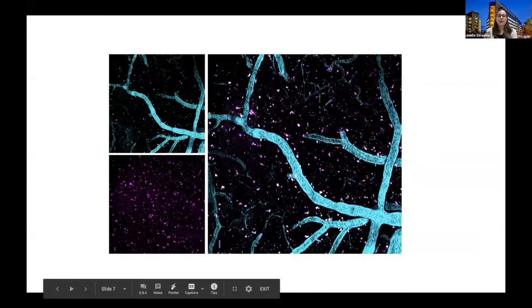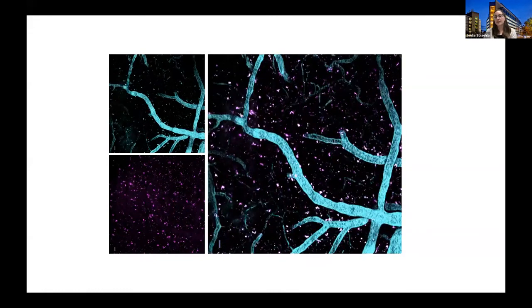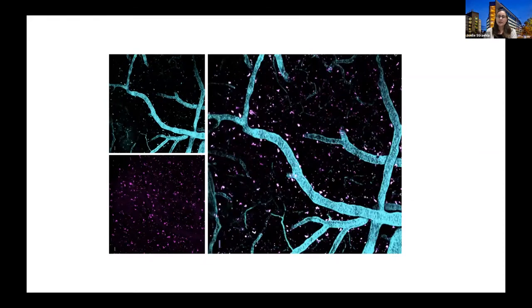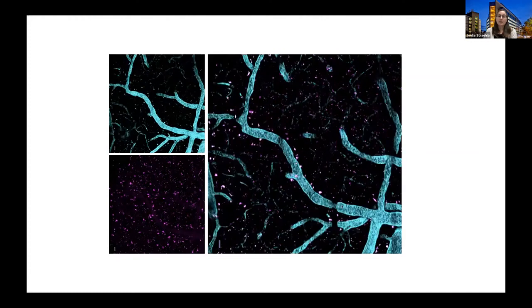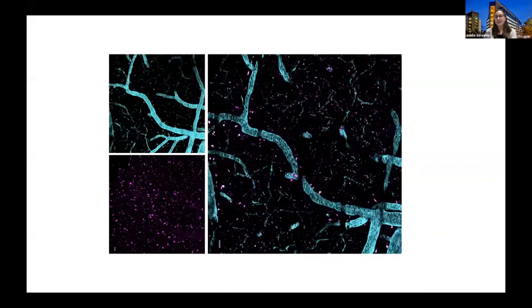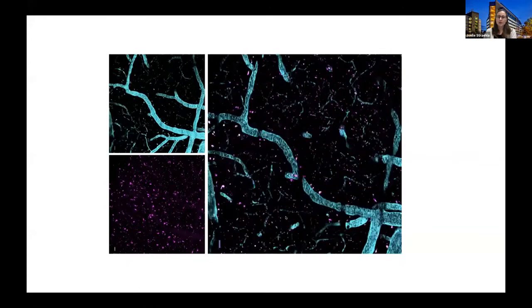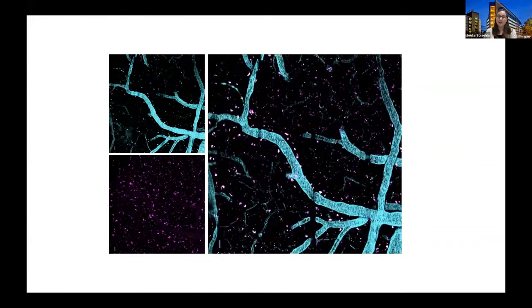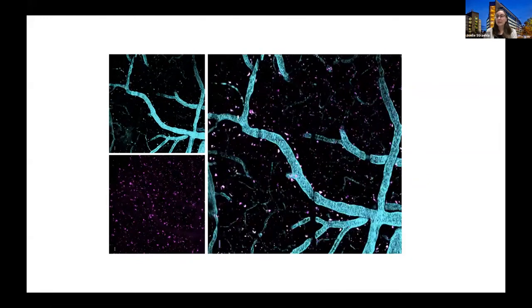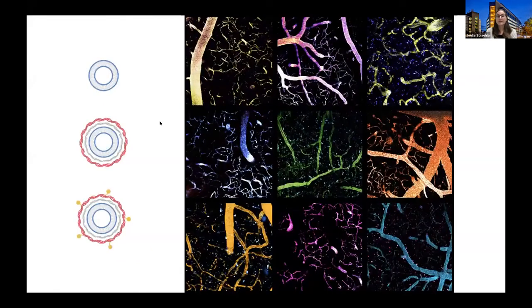Here you're looking at the blue with this vascular dye. The magenta is actually the nanoparticle signal, and then we've merged them together over here on the right. In this case, you can see that the nanoparticles are a little bit less in the blood vessels, and they appear as a speckled pattern throughout this dark area. Now, it's important to note that you're not actually seeing individual nanoparticles here because those are too small to really see, even at this level of magnification. Instead we're seeing cells that have taken up the nanoparticles and make this clumpy speckled appearance. So why are we doing this, and what is the point of taking these images?